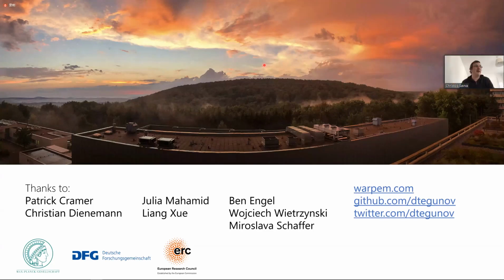Okay. A couple of similar questions from Liz Kellogg and Katerina Nedelcheva. Can you see what kinds of deformations are dominant contributors to the loss of image resolution? Is it doming or warping? Which of those motions do you see more prevalent? So for frame series data, doming, at least in the data that I've analyzed so far, has barely ever improved anything.